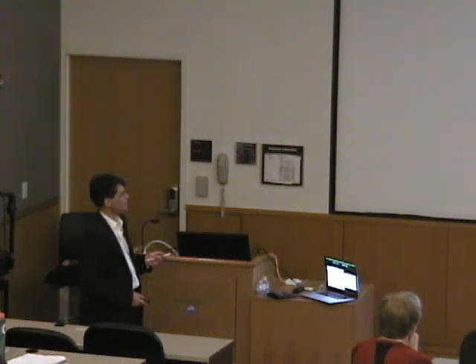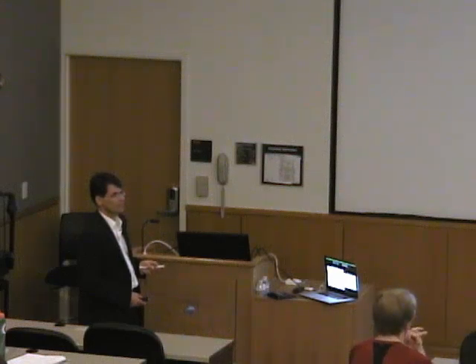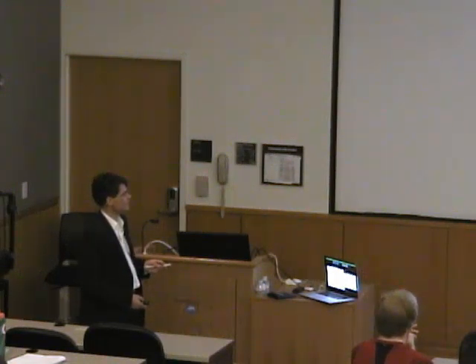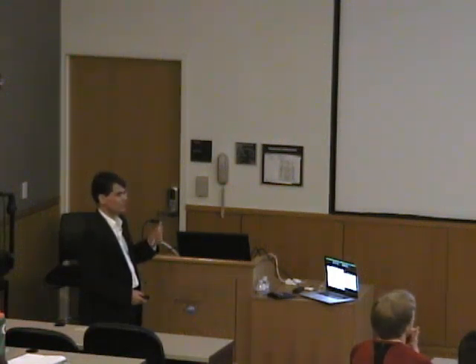Now, if you do the same trick in the presence of substrate, but the absence of dioxygen, right? So what you see is that there is another band growing in at about 5,000 wave numbers. So what has happened here? You have added substrate, and the coordination site has opened up, and then the active site iron is 5-coordinate, and it's a tetragonal pyramid. So here you have watched the enzyme in action.